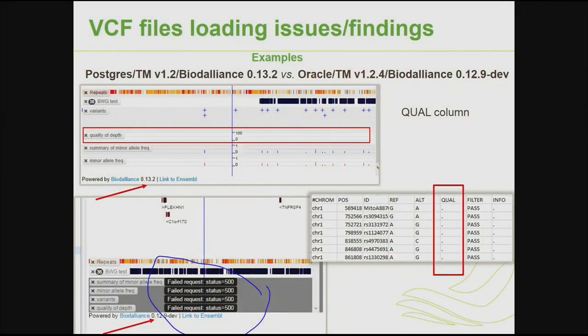Here is an example of how two different versions of Dalian's genomic browser work. There was a VCF file where the quality column was not populated, and it was okay to load this file in BioDalian's 0.13. Unfortunately, it was impossible to load it in an earlier version of the BioDalian's genome browser, so we had to populate that field in order to work with that version.